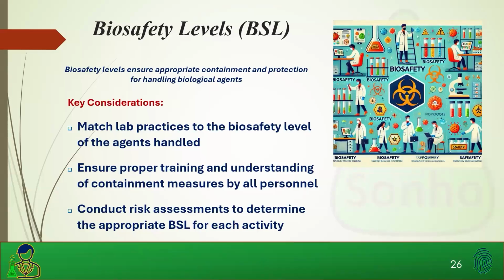Every activity is going to have a different BSL, but often they're grouped together. You must maintain the minimum BSL for your laboratory, whatever the activity you're taking. If you have one BSL-3 activity, your laboratory must maintain a BSL-3 level of containment.